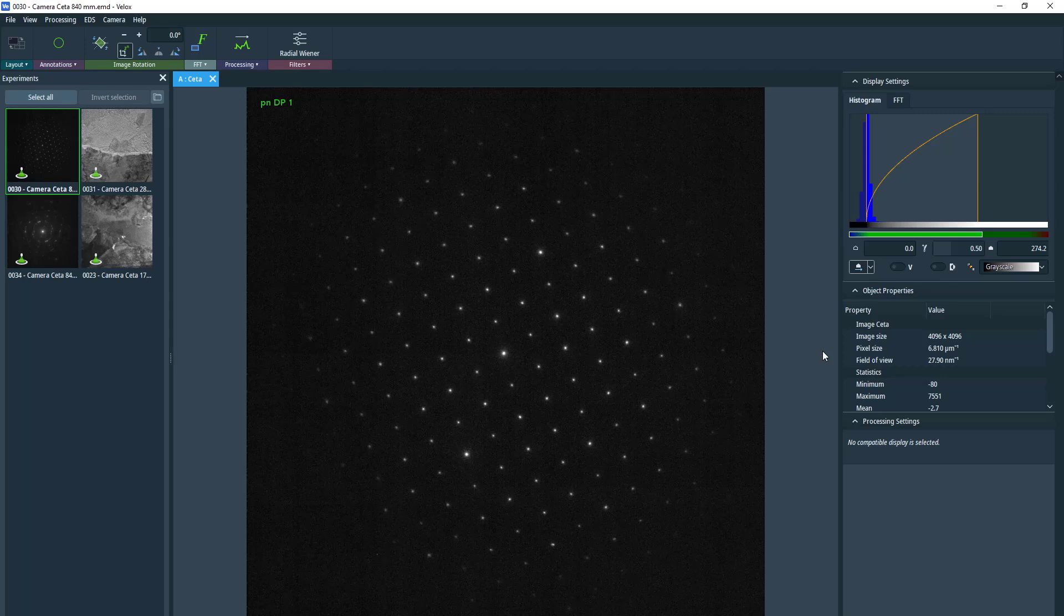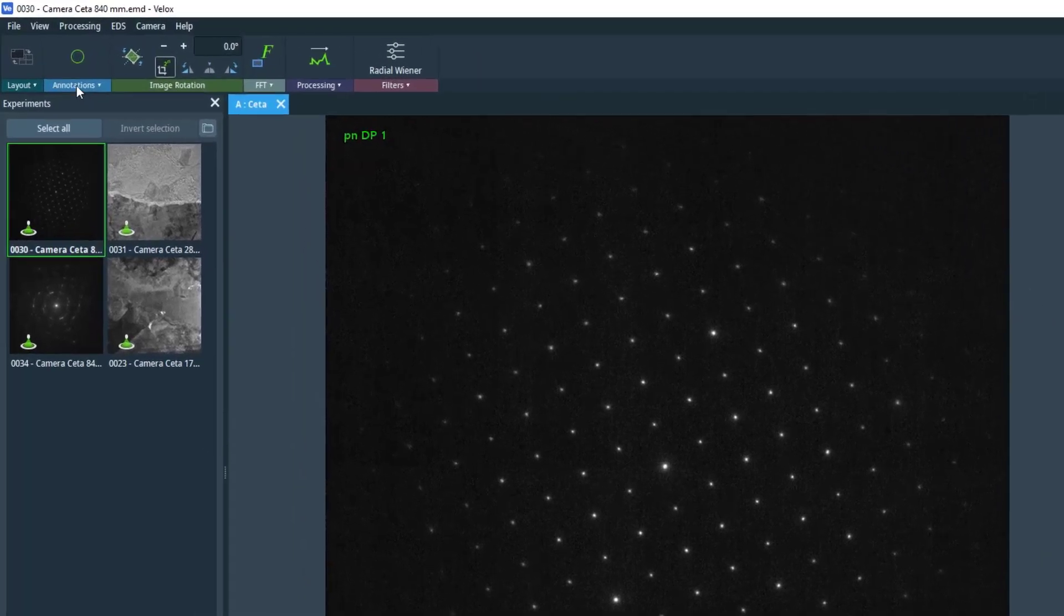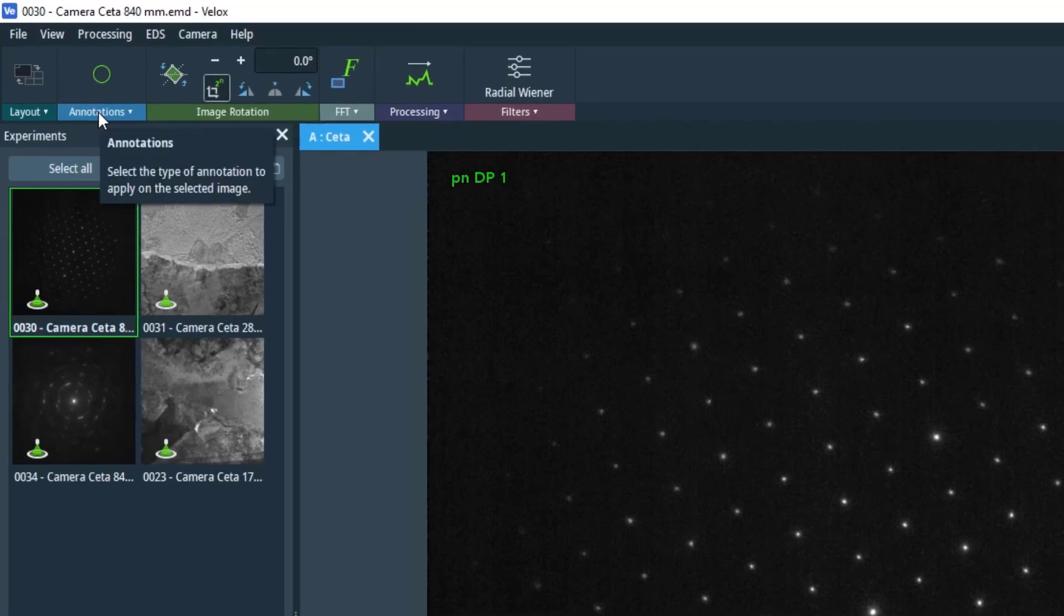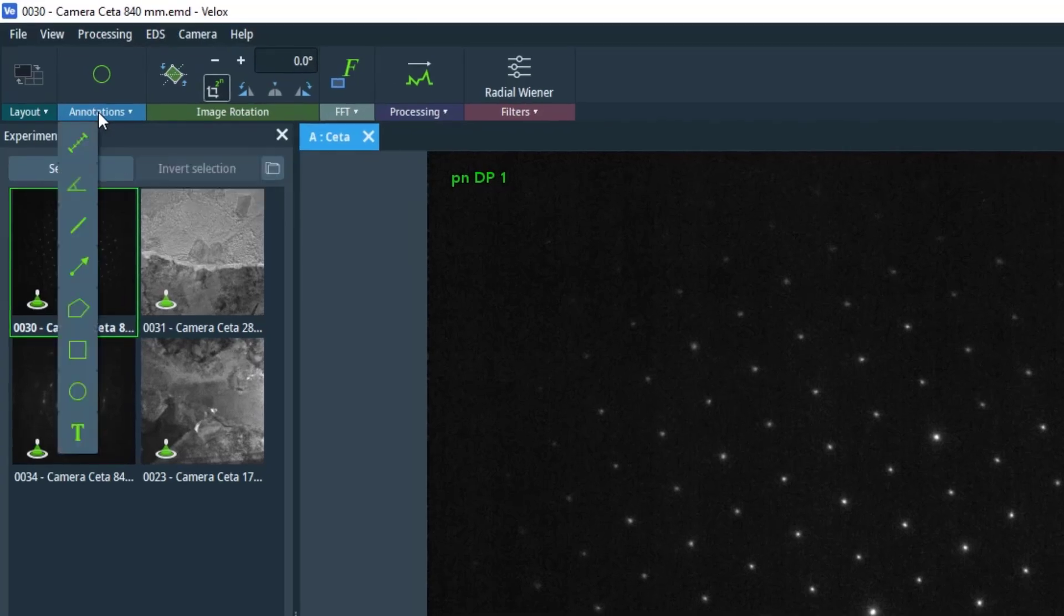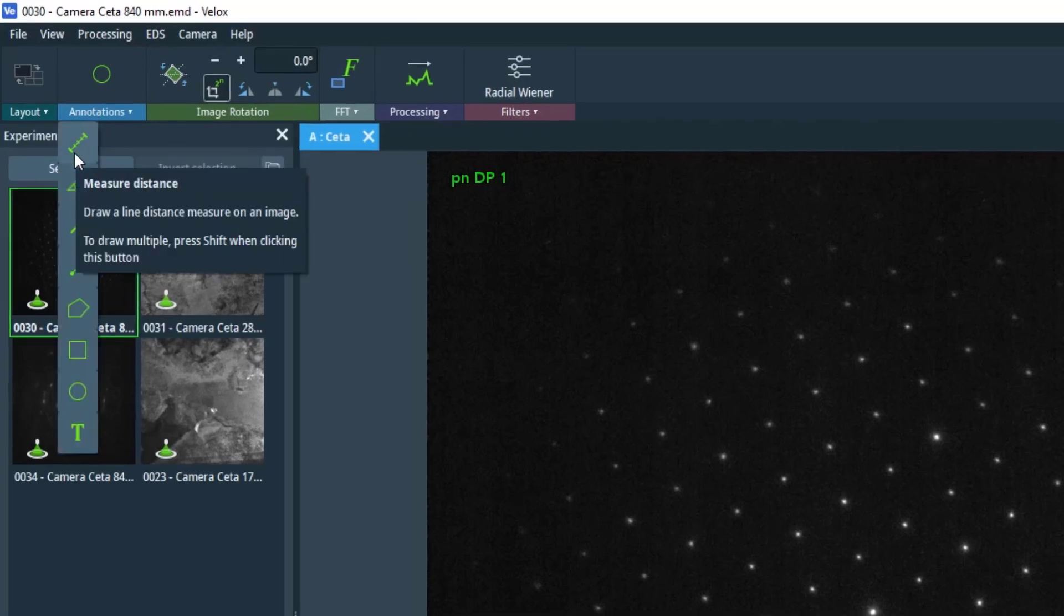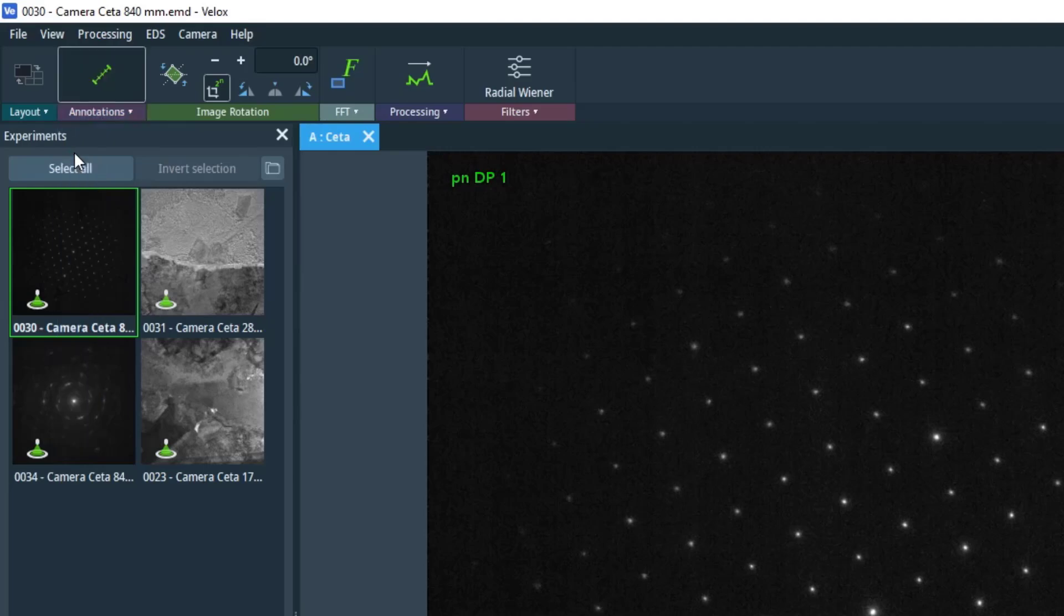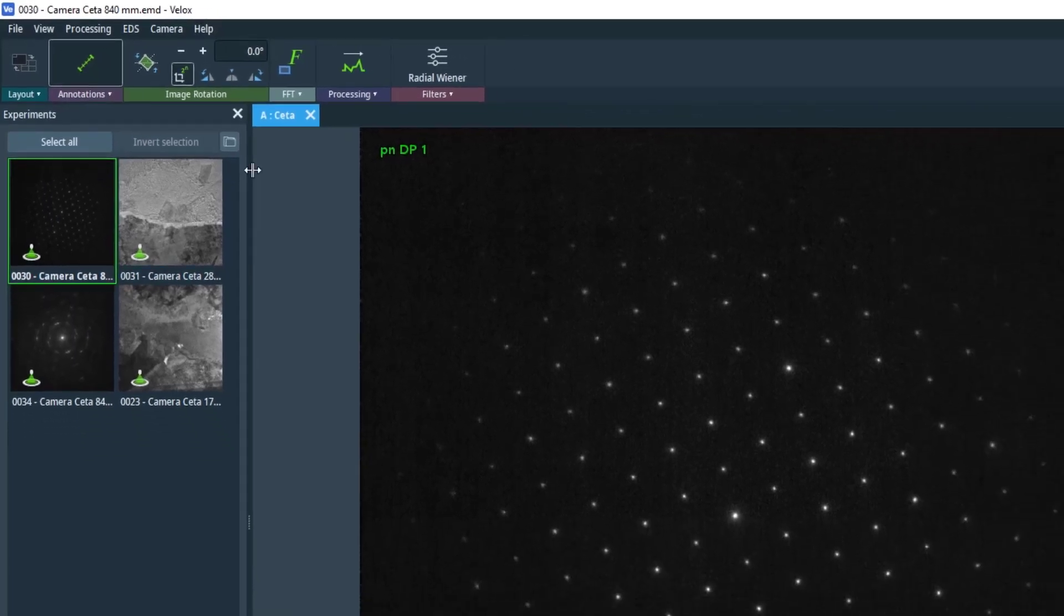So to start we have a spot pattern here, we're looking down a zone axis and let's pretend we don't know what this mineral phase is. The first thing we're going to do is measure the D spacings, so the space between the central transmitted spot and R1, R2, R3.